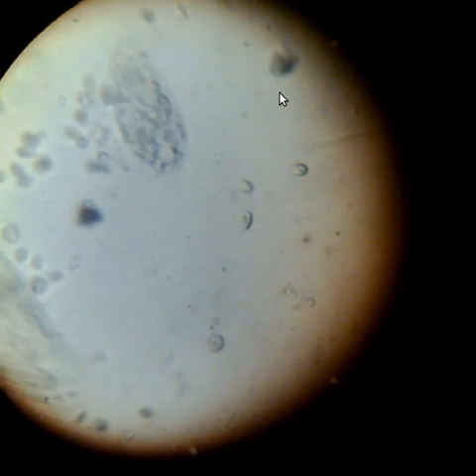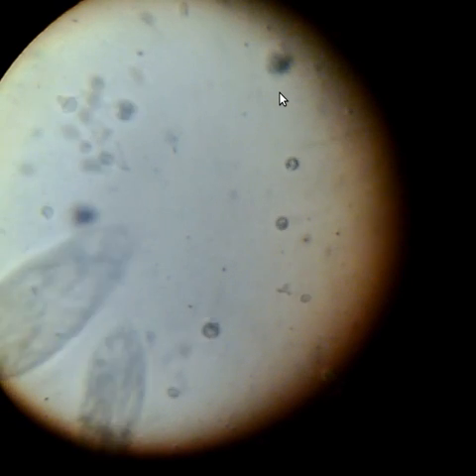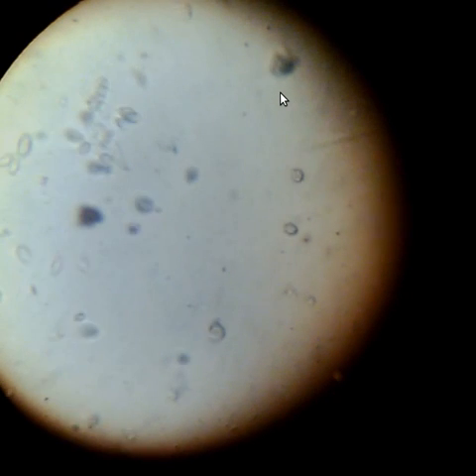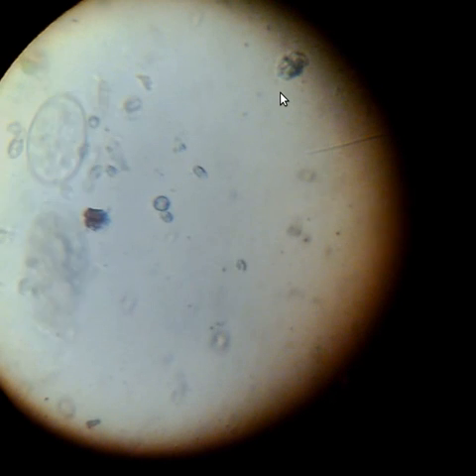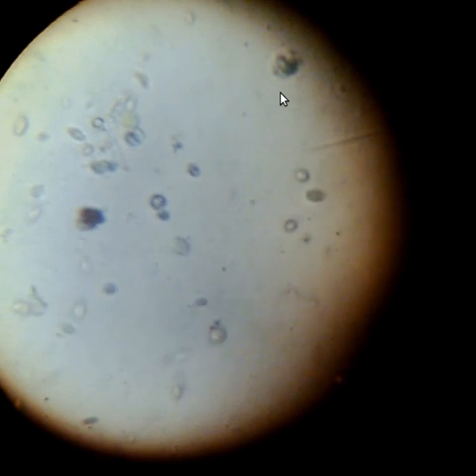These guys are going much slower and have basically congregated in an area — I guess that's where the oxygen is. I'm focusing in and out as much as I can. This is just a hay infusion, about five days old — just hay in water — and this is what you get. Anyway, I'm going to stop it now. I think that will be sufficient. Thank you.